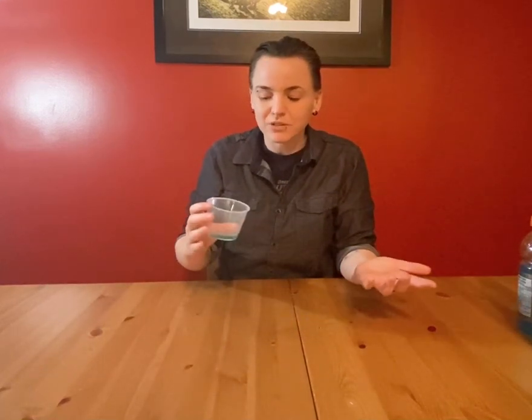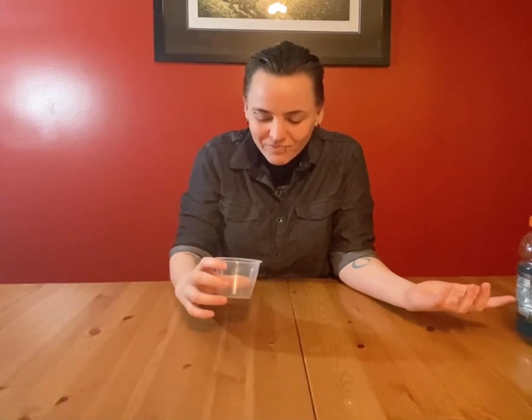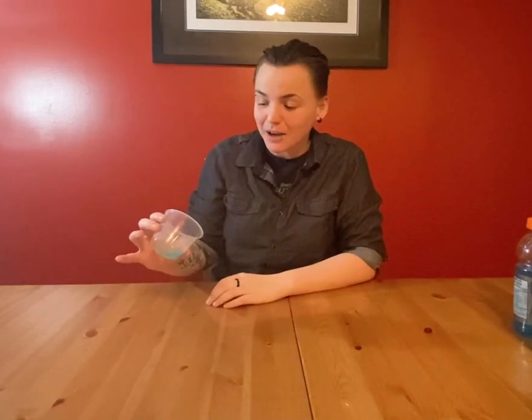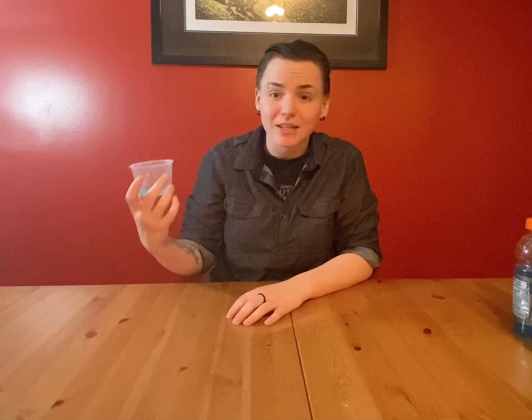So the first thing you do is you take the sports drink and you actually put it in your mouth, and you don't swallow it, you just swish it around. So you basically chew the sides of your cheeks, and your saliva is going to rush into it, and you're going to end up with a bunch of your genetic information in this cup.